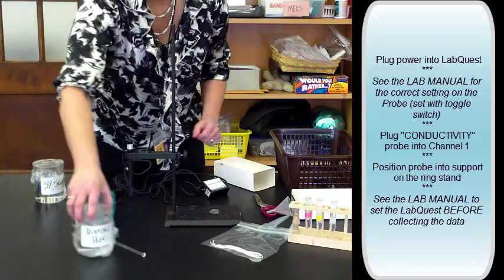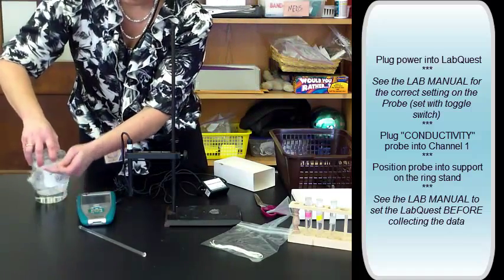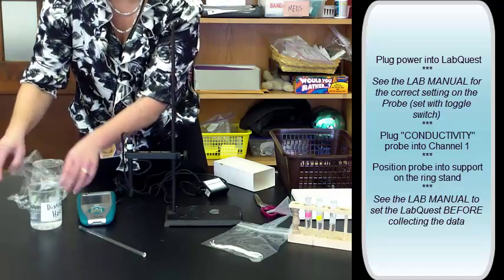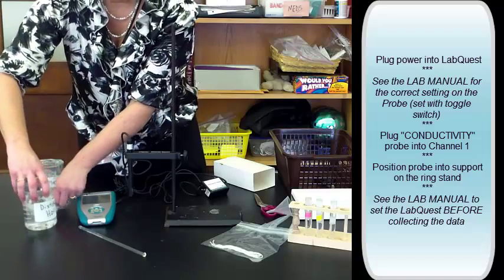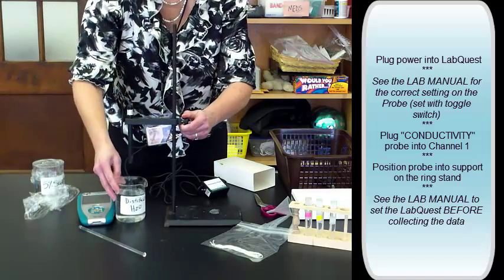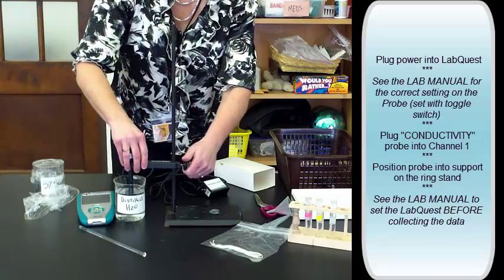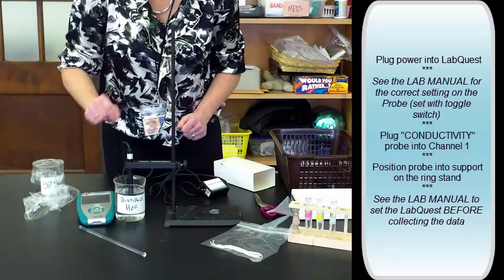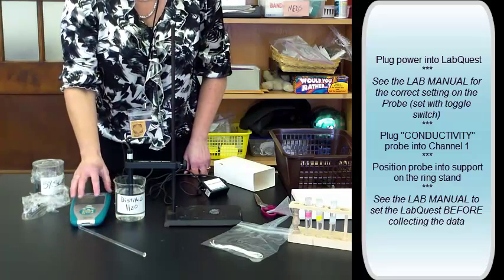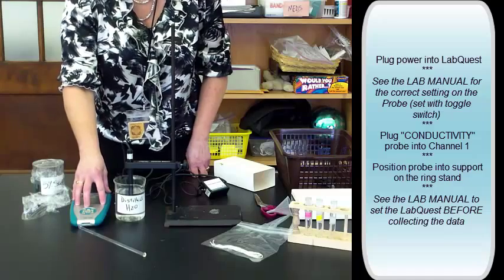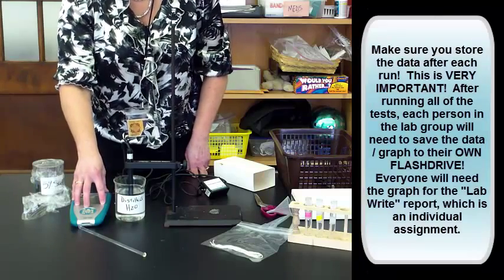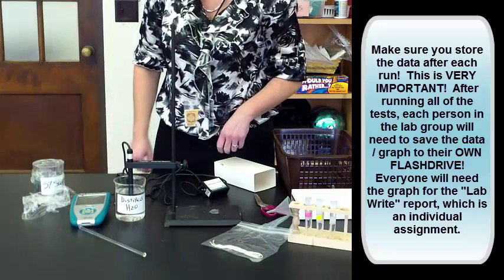Now our first test is we're going to use the distilled water. You will test the conductivity of the distilled water first. It's a matter of putting the probe in, and then you're going to record the value. So make sure that you look at the Lab Manual to see how to set up. You have to set the Quest up, it just doesn't automatically run, because you're going to be taking the graph and putting it on a flash drive to put into your report.